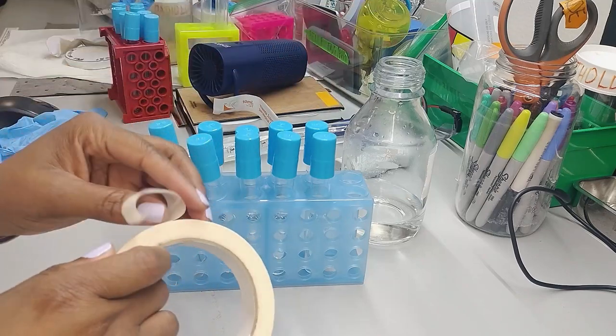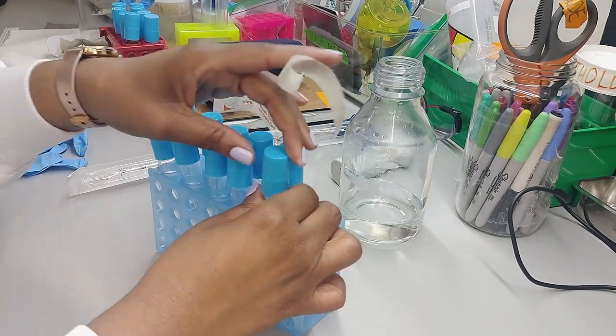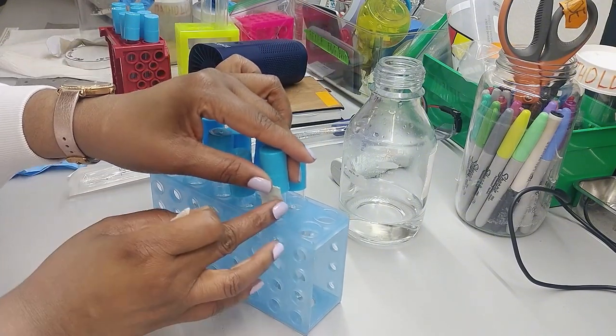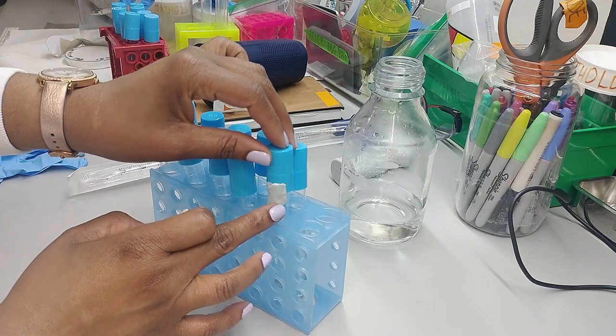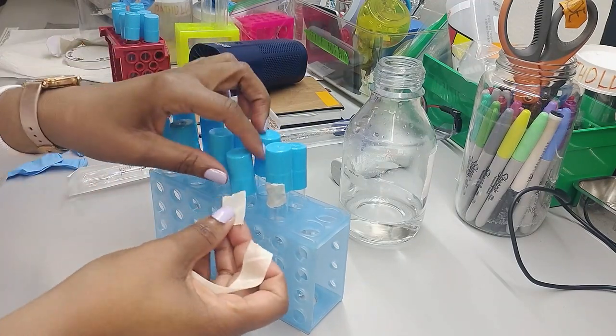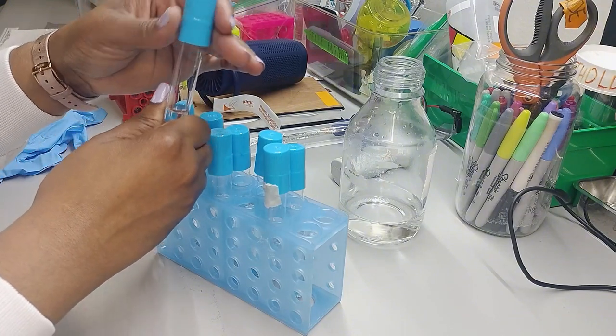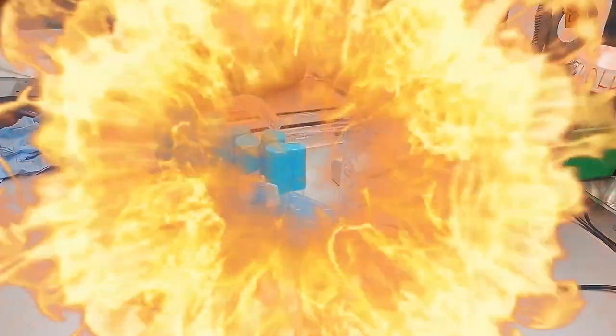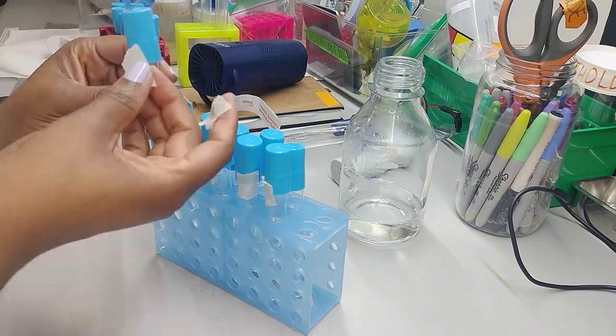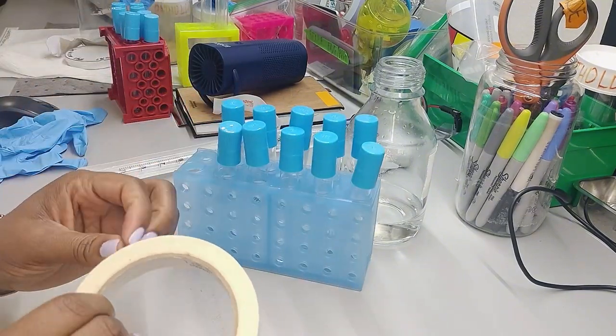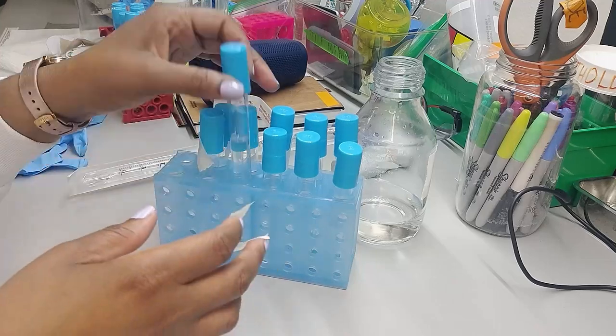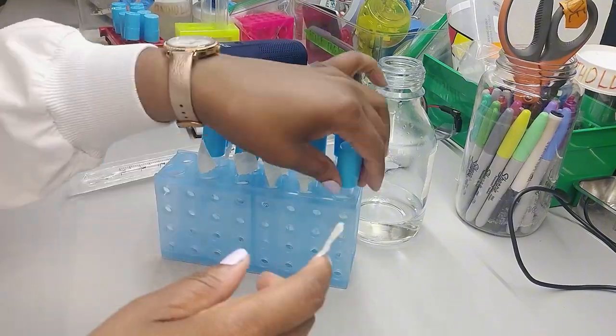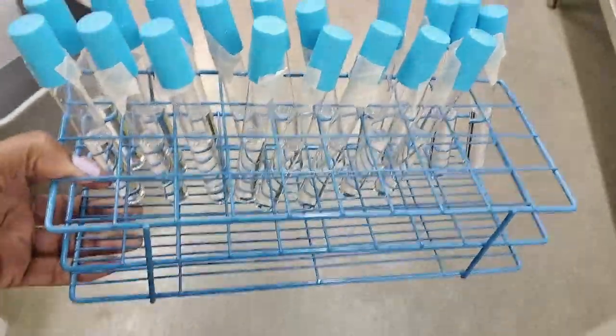I'm going to put autoclave tape across each of them so that way I know that they didn't open during the autoclaving process or someone did not open them. So it's just across a part of the lid and the neck of the test tube. I'm going to slightly unscrew it because if not, if it's on too tight, the pressure will build up in the autoclave.